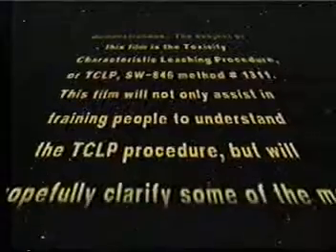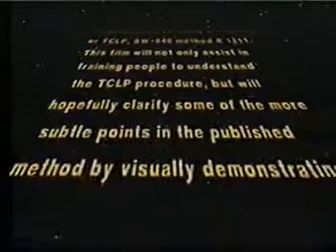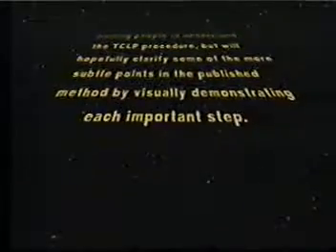SW846, method number 1311. This film will not only assist in training people to understand the TCLP procedure, but will hopefully clarify some of the more subtle points in the published method by visually demonstrating each important step. I'm Glenn Abbott. I will narrate the procedure, which will be demonstrated by analytical chemist Bill Charlton.